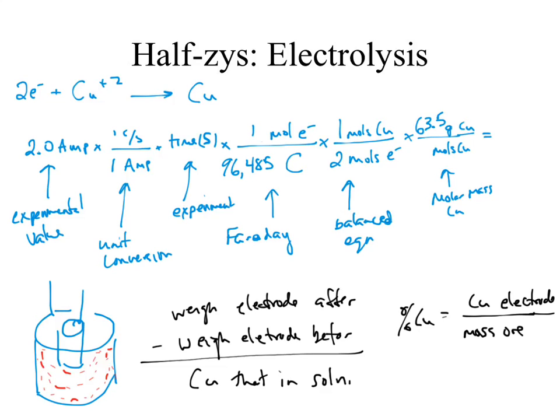So when you get into lab, like I said, immediately try and get this set up, get it dissolving. This is the clutch experiment. You want to be the first to be done with this experiment, okay? Which means get it ready to go as fast as you can, and then you can make sure that you're ready to run everything else. And you should get done early, if not on time, with the whole experiment, okay?